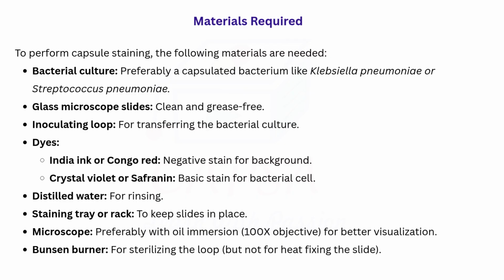Here is one important note. We do not heat fix the slide during this staining process because heat can damage or distort the capsule. This is a crucial point for students to remember.